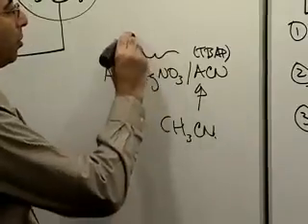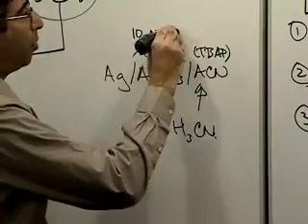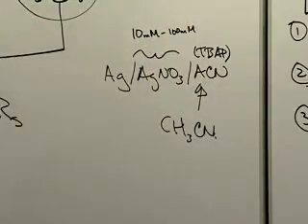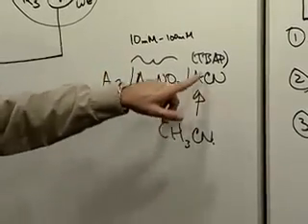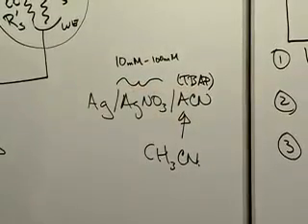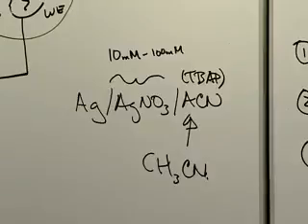And people use anywhere from 10 millimolar to 100 millimolar silver nitrate, and of course what you pick here does change the potential of your reference electrode, so you have to figure that out. And then you have acetonitrile, and usually between 0.1 and 1 molar tetrabutylammonium perchlorate as a supporting electrolyte. So what's the downside of this?